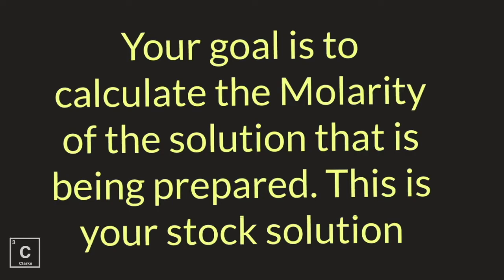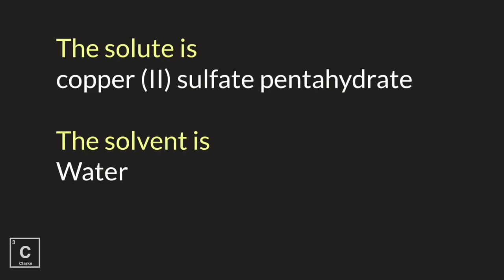In this lab there's going to be two goals. Your first goal is to calculate the molarity of the solution that's being prepared. We're going to call this your stock solution.